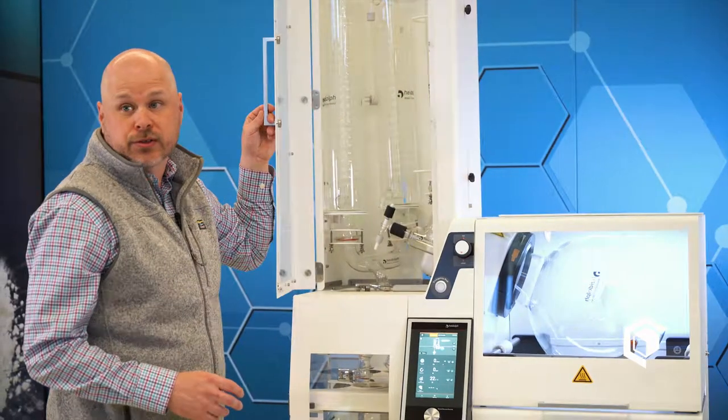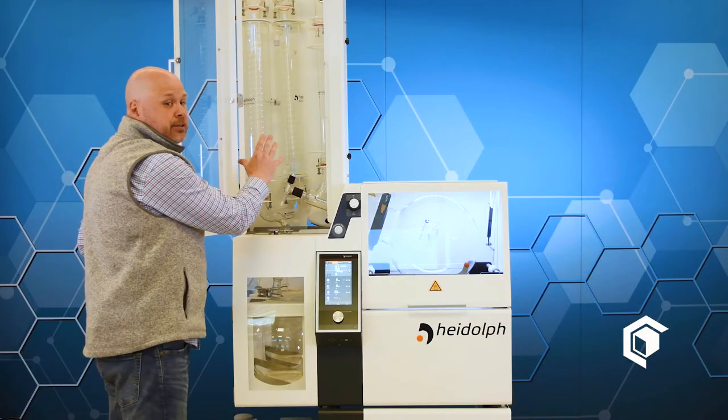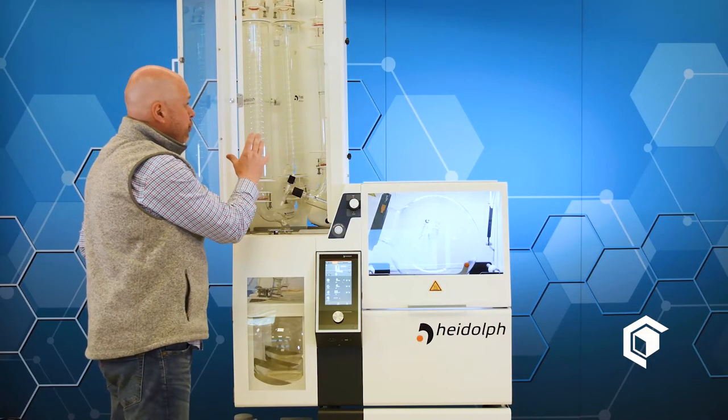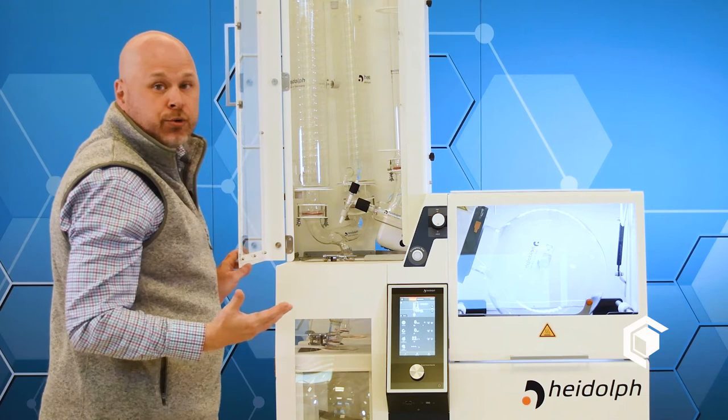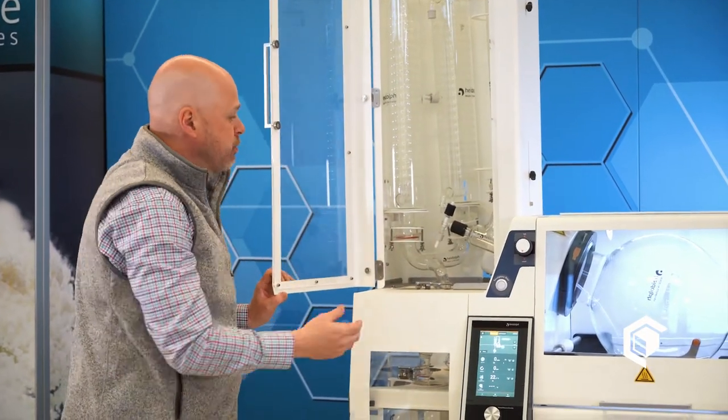Let me show you a few features of the configuration of the double coil condenser. You can see the dual condenser setup, and this gives you the highest recovery rate of ethanol possible — you recover over 99%.